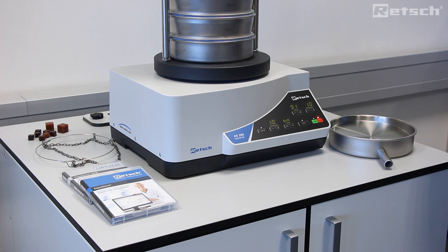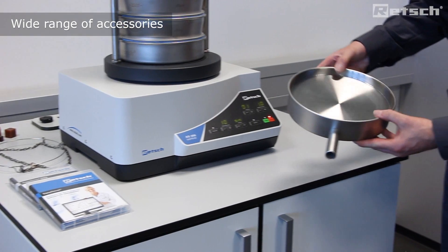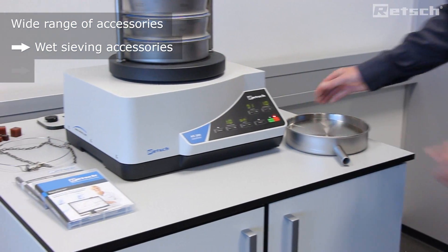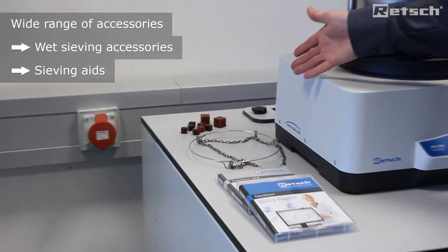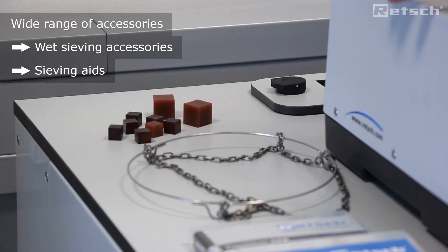The AS200 series of vibratory sieve shakers can be supplied with a wide variety of accompanying accessories to facilitate both wet and dry sieving applications. Here we can see a collecting pan with an outlet for wet sieving. Furthermore, we can provide a wide range of sieving aids, particularly important when sieving fine materials to prevent agglomeration.